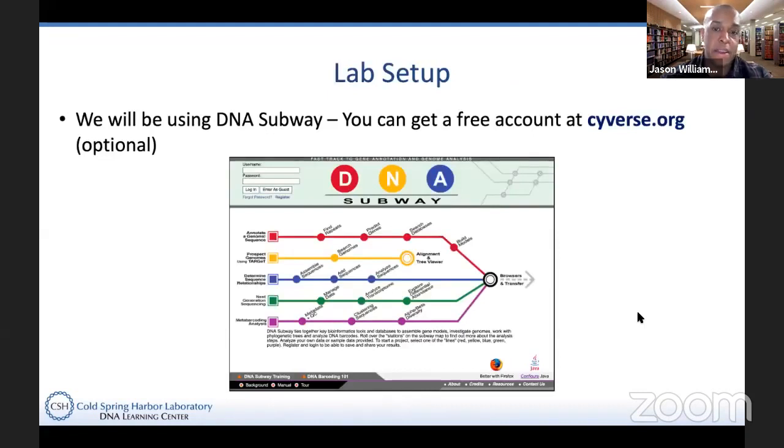We're using DNA Subway, and we've mentioned this. If you Google it or if you haven't bookmarked it yet, you can find it by doing a Google search or going to cyverse.org. You can sign up for a free account. I encourage you to use the opportunity to sign up for that account because your work will be saved. You can use it without an account this time, but go ahead and sign up when you have a chance. I believe the next couple of weeks, the next series, will require an account, so you might as well do it now.